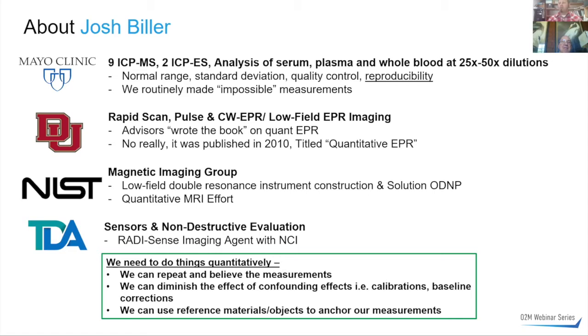And you do that by knowing what the measurement is that your instrument is making, and making it in a quantitative and reproducible way. So then I went on to DU, and people like to throw the phrase around, well, so-and-so wrote the book on some topic, but my advisors did. Gareth and Sandy Eaton put it together in a very just-the-facts-ma'am title, Quantitative EPR. And so that quantitative measurement was reinforced.